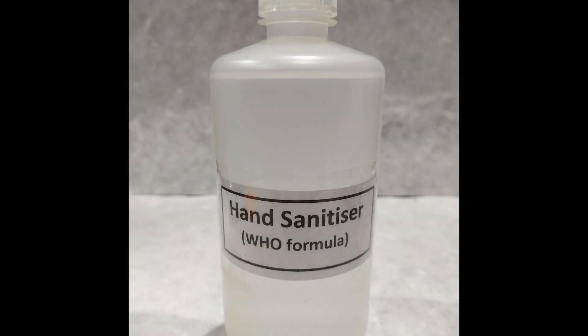In this video, we'll be preparing 500 ml or half a liter of hand sanitizer. For volumes more or less than 500 ml, adjust the quantities of the ingredients accordingly and proceed.